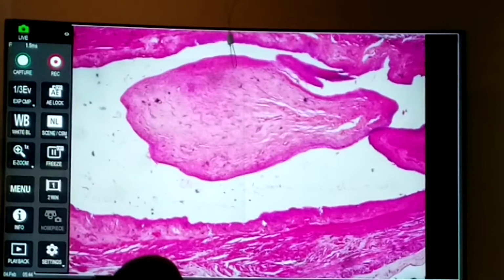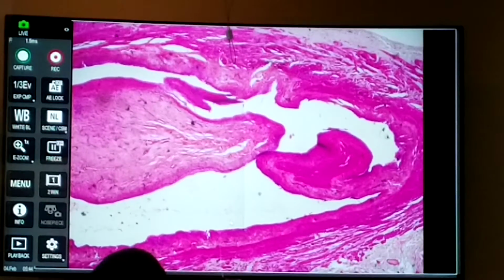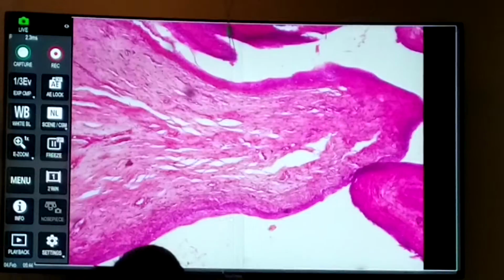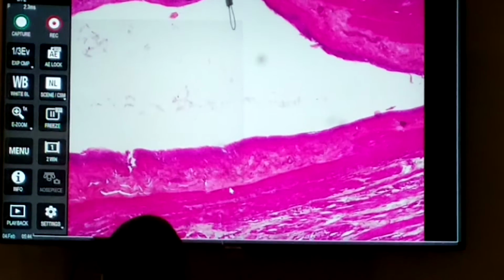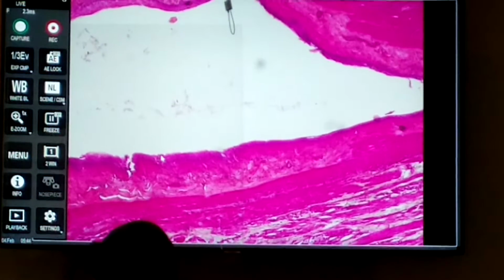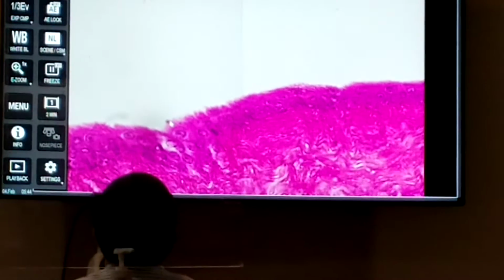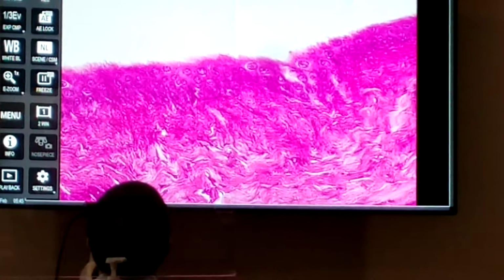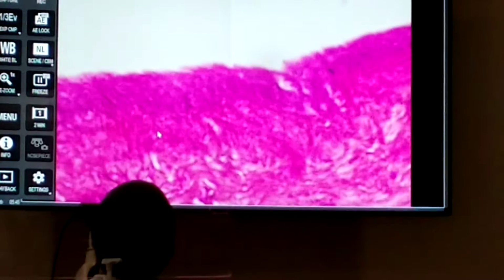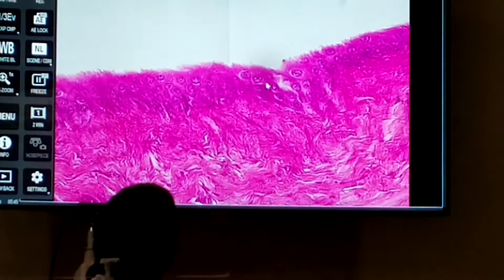So here's a space here. So this has to be the epithelium that lies in here. See if we can take a close look at this epithelium here. And I can tell even at this low power that this is stratified. You have multiple layers. Okay, so eyeball this. You get like one, two, three, at least four different layers of cells.